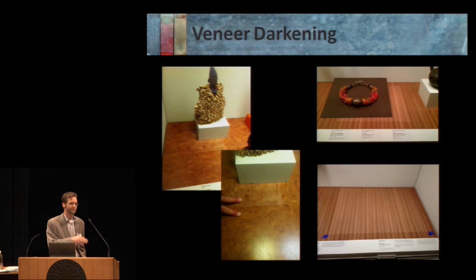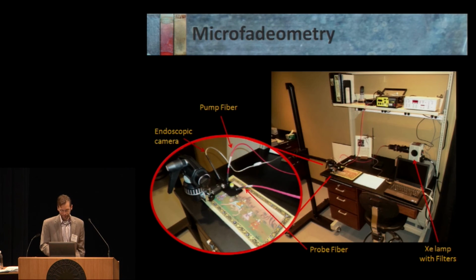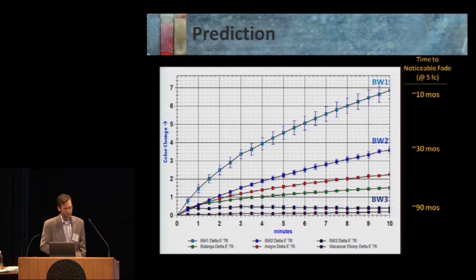And again, these are the sorts of things that now we're prepared to pick out and to identify using techniques in the laboratory. So one of those would be the microfadometer, which was originally produced to make analyses of light fastness of artworks, but the same principles are at play with the construction materials, so we can use it there as well. You've got this intense xenon light source that's delivering light to a pinpoint on the surface of your object or your material. Another fiber optic is picking up the scattered light that your eye senses as color, and we're measuring that color to generate charts like this, where we can track the color change as a function of exposure to the light source. And these are relatively short 10-minute experiments.